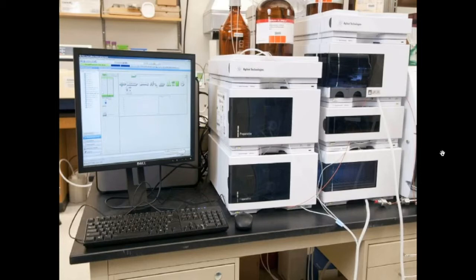This instrument is called HPLC. The full form is High Performance Liquid Chromatography, or it is also called High Pressure Liquid Chromatography, because it uses a pump to push the mobile phase into the column. This is a very important instrument and very widely used in pharmaceutical analysis for the separation as well as the analysis of various ingredients.